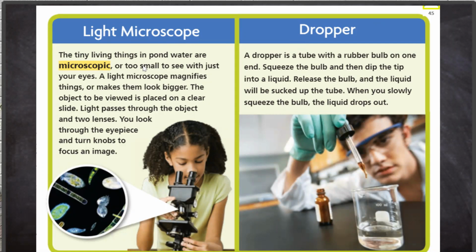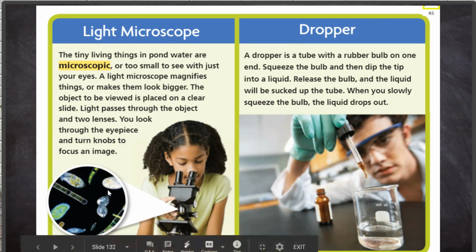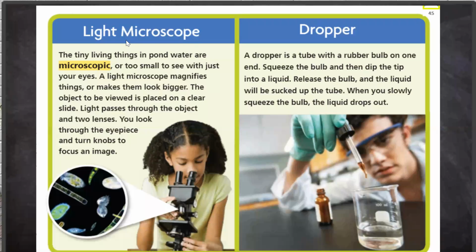The first tool over here, what can you see, Feiruz? What is this? It's an eye tool. The one you can see little things with. Like a light... Microscope. Okay, thank you, my dear. You can see little things. Over here, it's a light microscope.